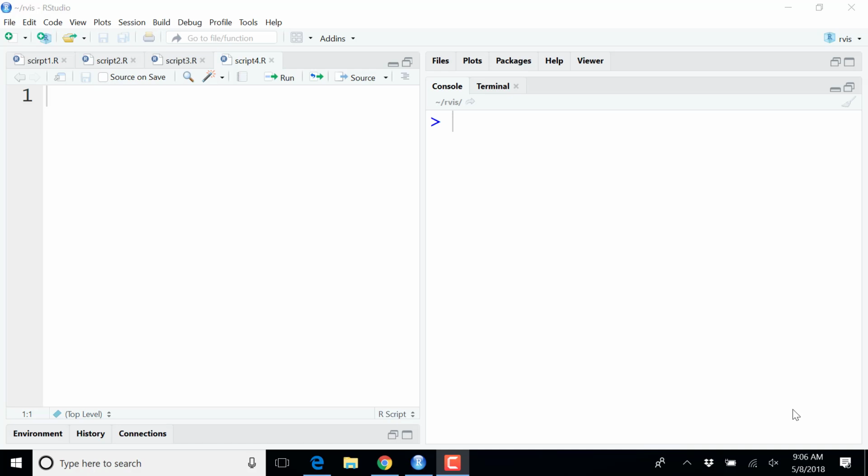And so it becomes very easy to spend hours trying to produce a plot, and then at the end of the day, the plot doesn't communicate at all what we want to do. I mean, that's useful because we learn some new syntax, but we must not forget that at the end of the day what matters is what we want to communicate. It's the actual figure we want to show.